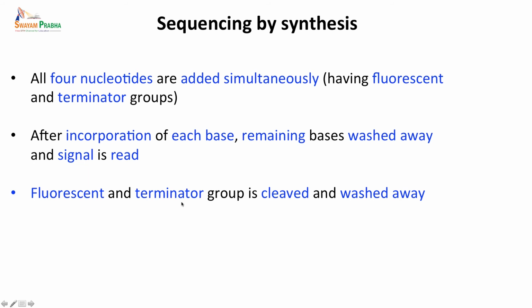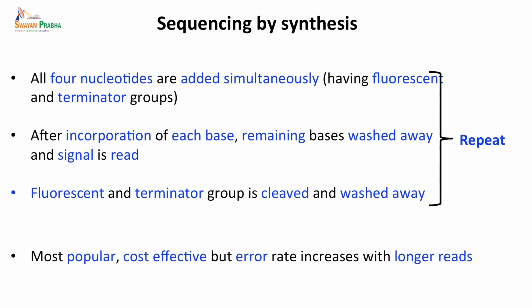So this is a very popular method that is used very often, and repetition of these cycles gives you a complete read. Although this is very popular and cost effective, once you have very long reads, the rate at which errors are incorporated is also much higher.